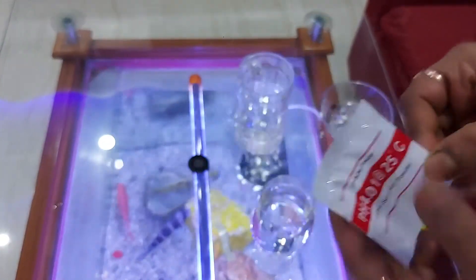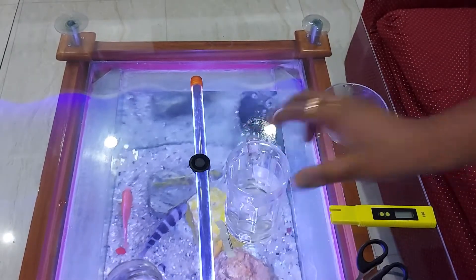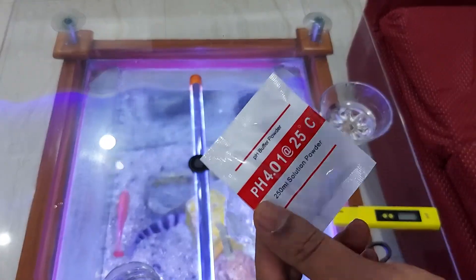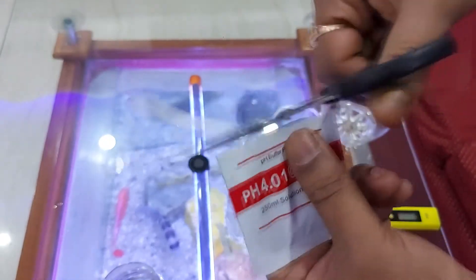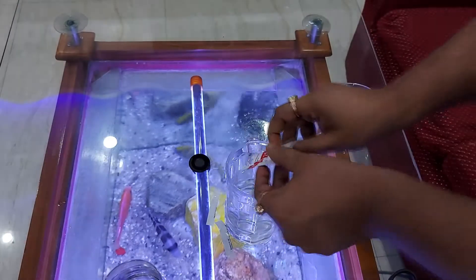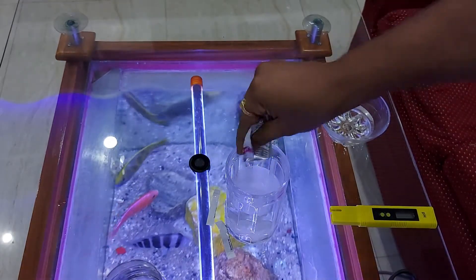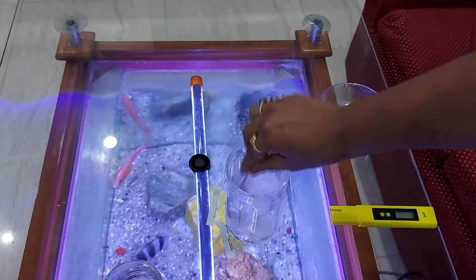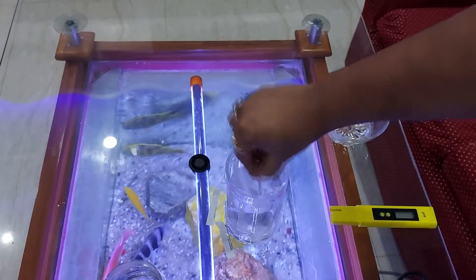Now let us take the second pH solution, 4.01. Take the other RO distilled water cup and pour the entire pH 4.01 powder solution into the cup, just like the first one. Mix it thoroughly so that there is no residue left — mix thoroughly with a tablespoon or teaspoon.